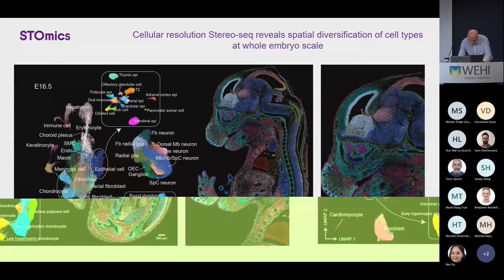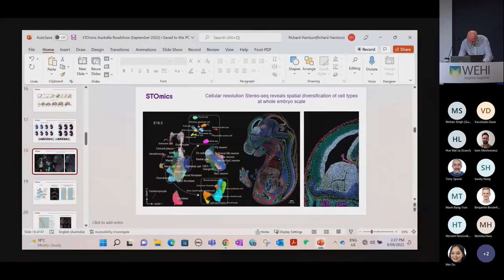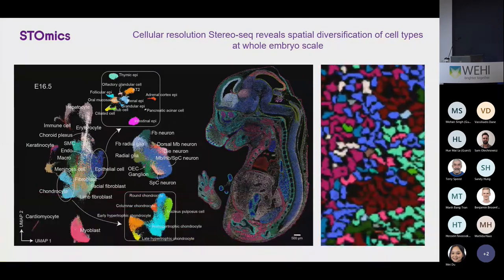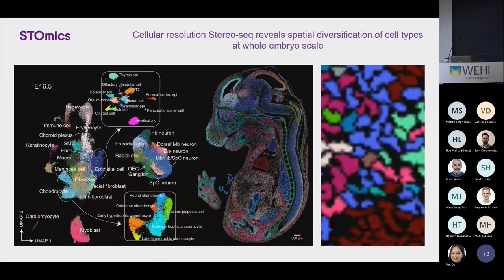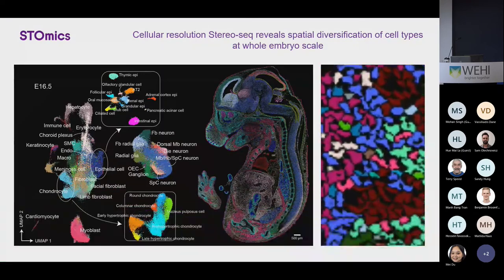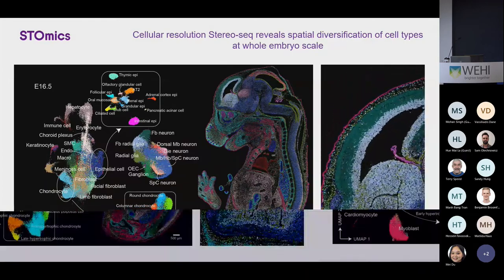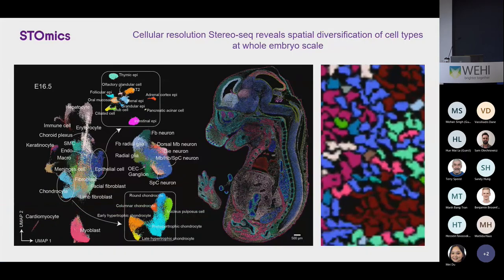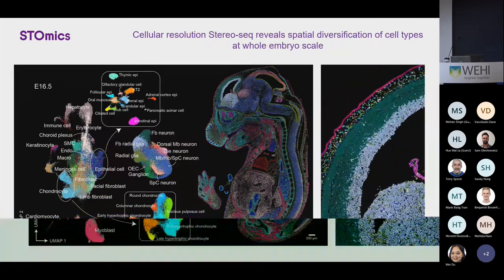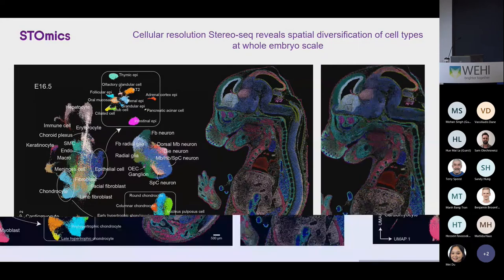If you think about the transcription and translation process, it starts with raw transcripts that have introns, and then they're spliced out to form mature transcripts, and then they're translated and then degraded. If you look at the changing percentages of intron reads and exon reads, you're actually able to see in progenitor cells in the brain, for example, over here, the directionality that new cell types are being formed, the directionality of differentiation, and the vectors for how these different layers are being created and populated.